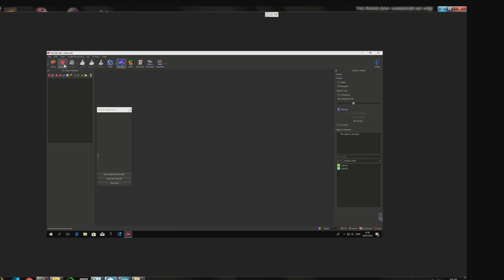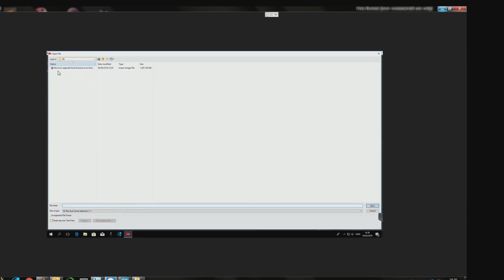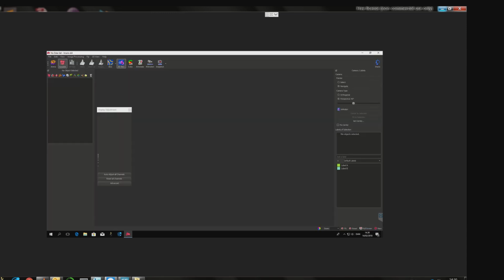If you're working on case A, then you directly go to File, Open, and go to the network drive. For example, in my case, it's Danstem Common, whatever the network drive is, that should be okay. As long as you're working on the network drive, that's fine. You import your data, you process your data, and then you save back to the network drive. So you don't use the D drive and C drive at all.